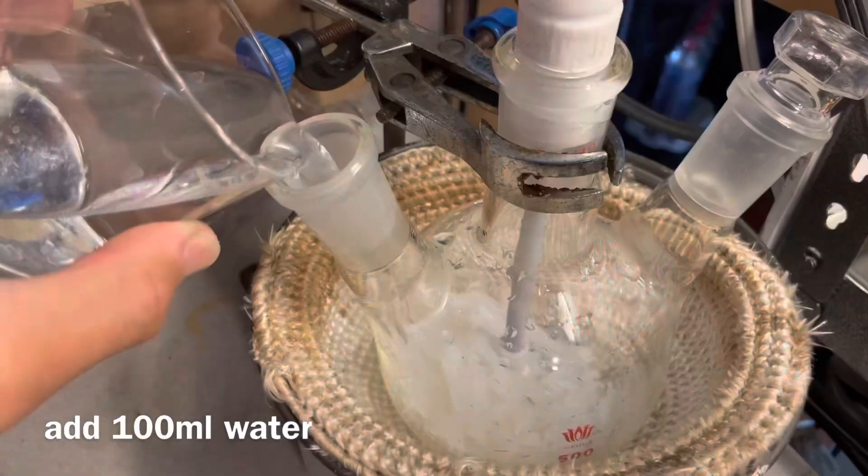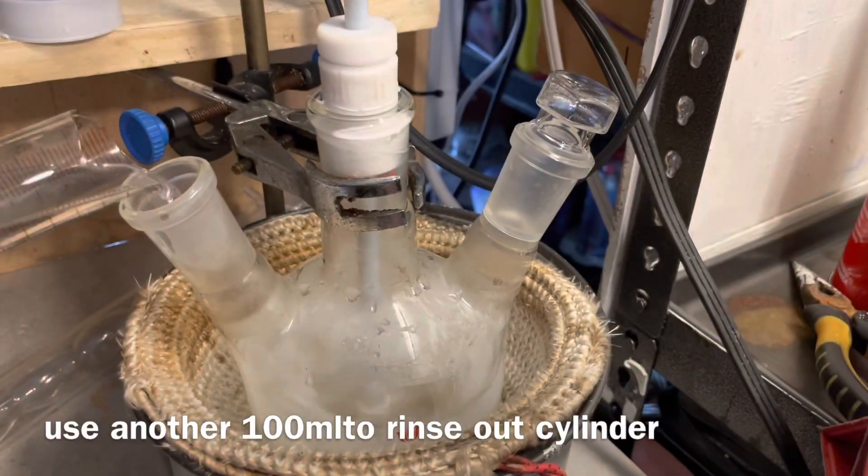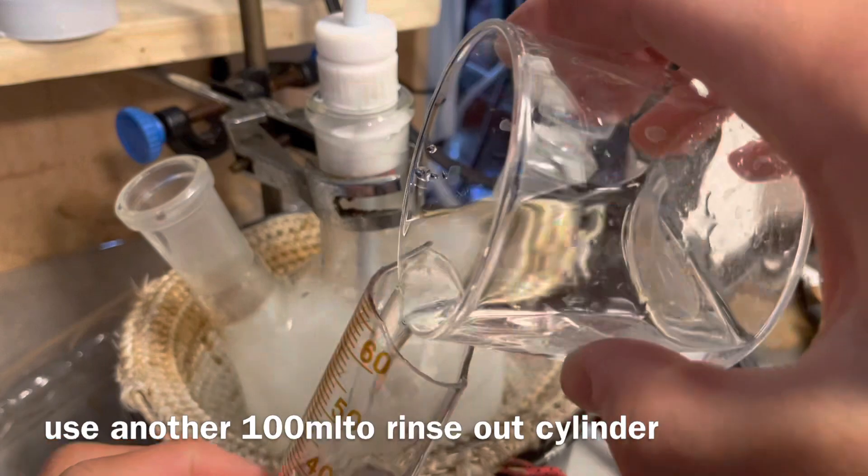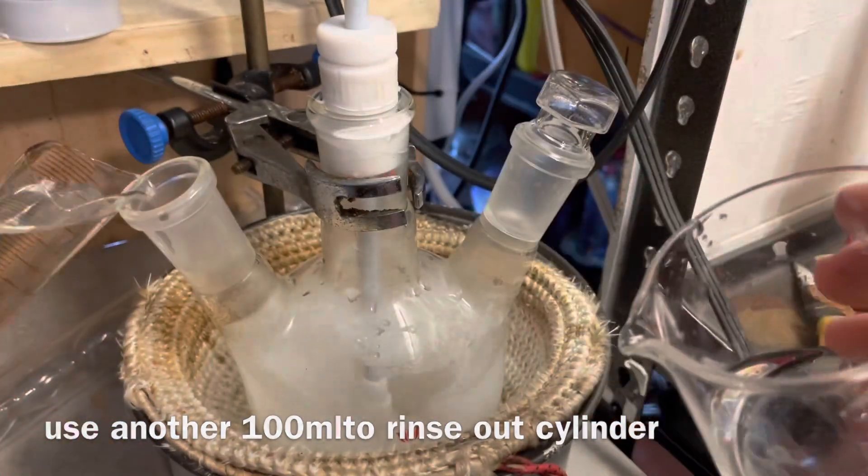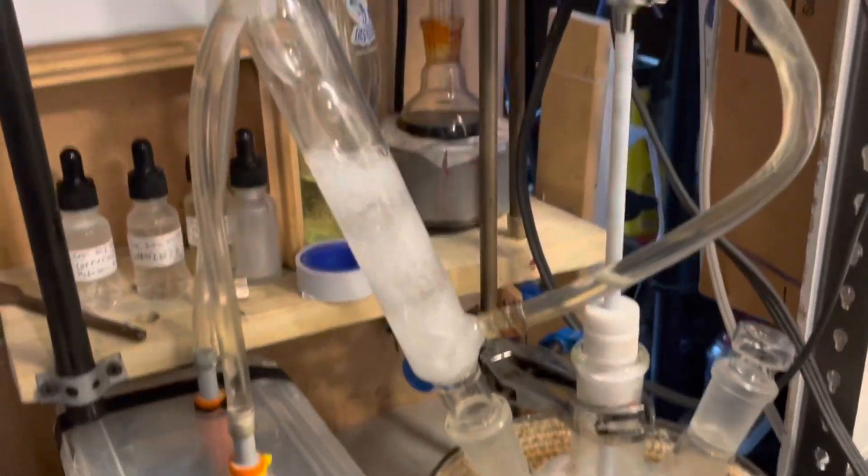Now add 100 milliliter of water and 35 milliliter of sulfuric acid, and then rinse out your sulfuric acid measuring apparatus with some more 100 milliliter of water. Add on a reflux condenser, and now we have to bring it to a light reflux.